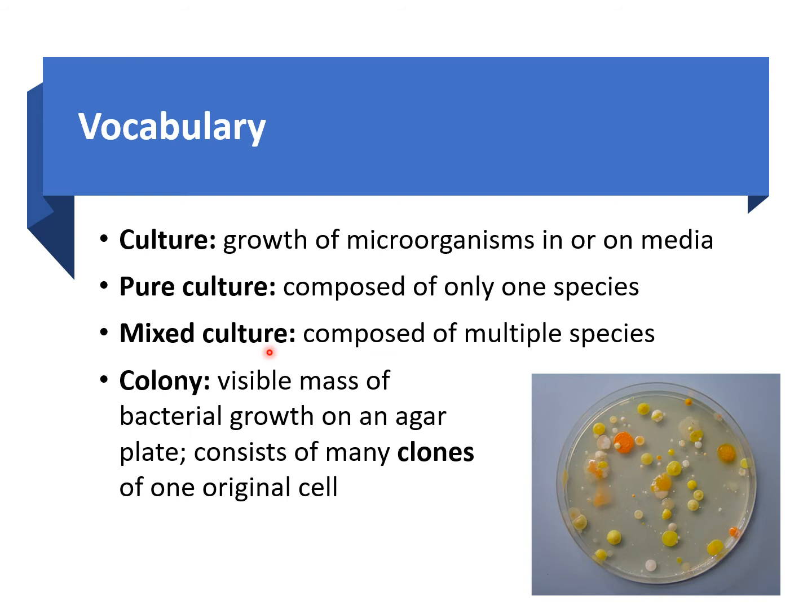Now, if you don't spot any differences and the colonies all look exactly the same, then you're probably looking at a pure culture, meaning that you're looking at a plate that only has one species of bacteria growing on it.